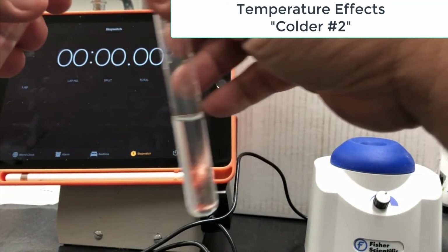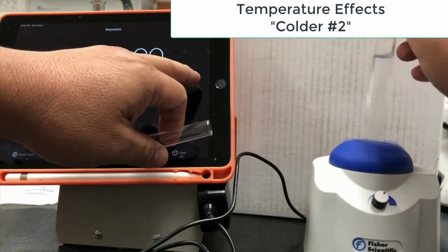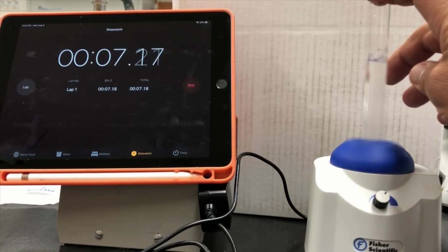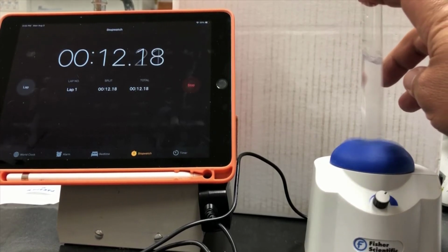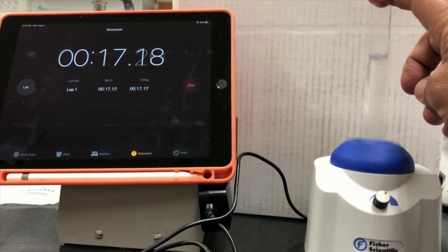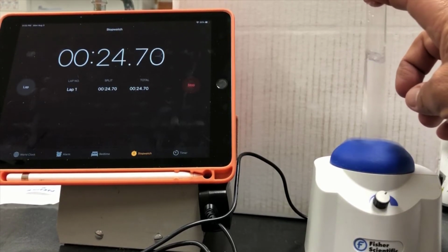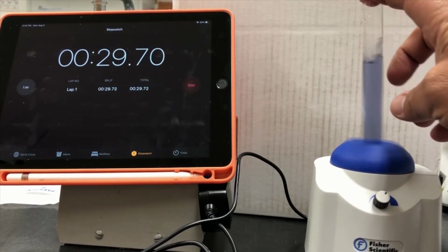I'll mix these together, start the time, and we'll record the time that it takes to change color. Go.